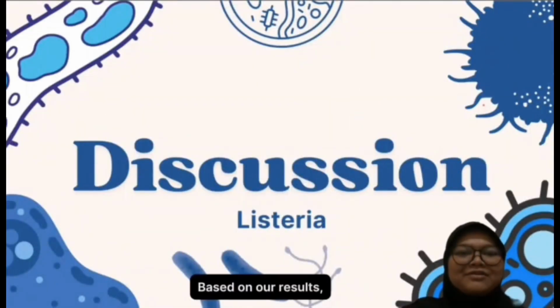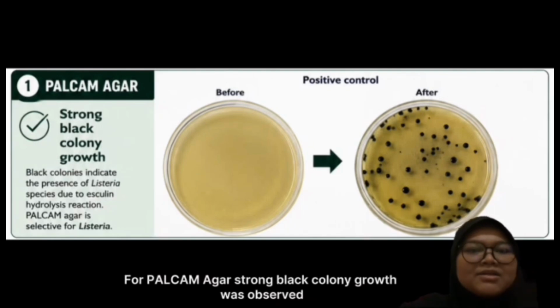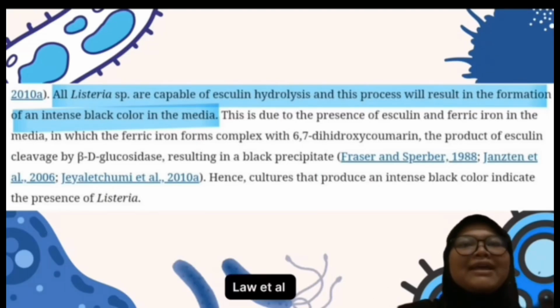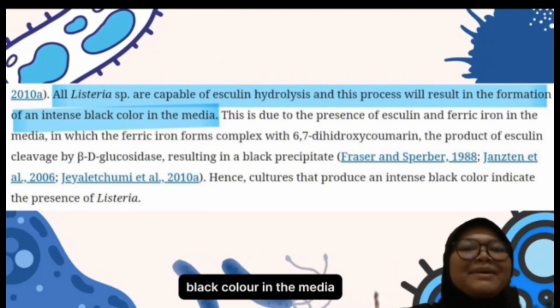Based on our result, the positive control shows successful growth of Listeria on both Palcam agar and TSA agar. For Palcam agar, strong black colony growth was observed, which indicates the presence of Listeria species because this medium is selective for Listeria. Law et al. state that all Listeria are capable of esculin hydrolysis, and this process will result in the formation of an intense black color in the media.